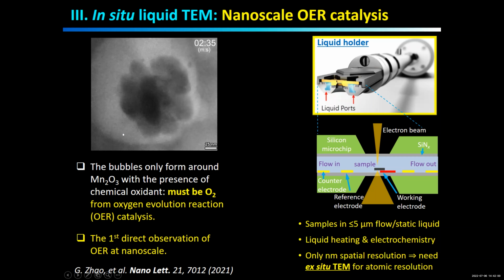May I ask a question? Yeah, sure. Hi, thank you, Peter. Thank you very much, Dr. Zhu. Very interesting topic and very fascinating technique. I'm wondering, because you want to do a lot of in situ technique, right? In situ TEM. How in situ can it be? For example, the pressure, the temperature, especially when you talk about OER, HER, maybe photocatalytic, thermocatalytic. What is the limit currently, and how to improve it?